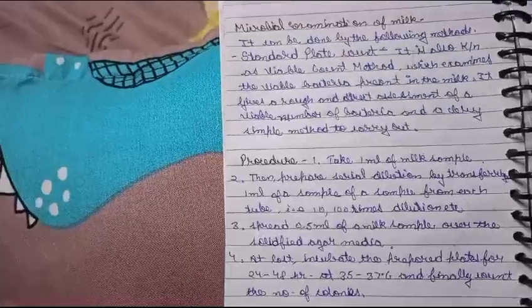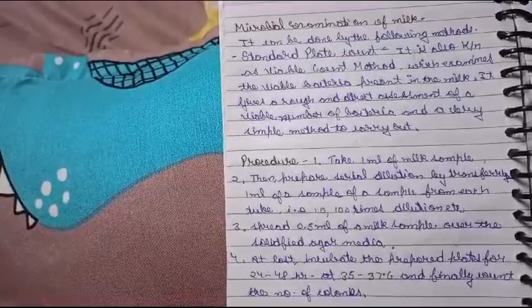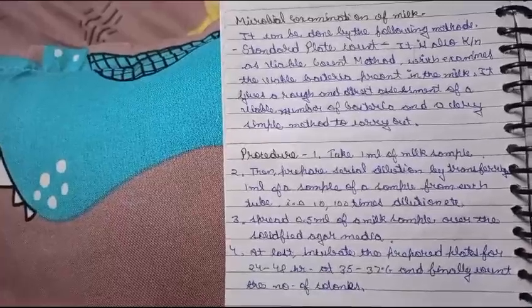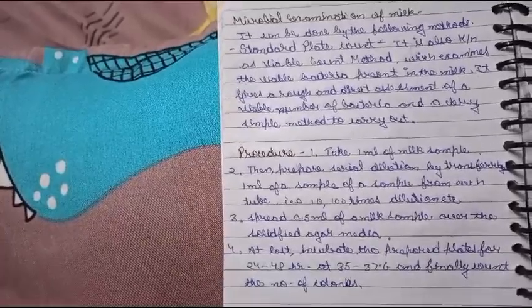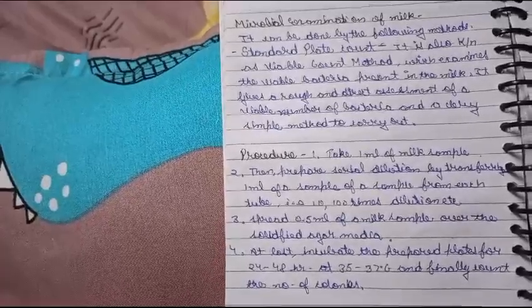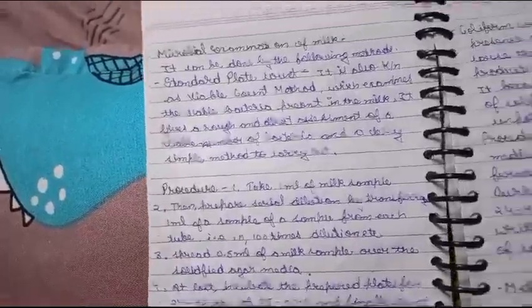from each tube, that is 10 to 100 times dilution, etc. Spread 0.5 ml of the milk sample on solidified agar medium. At last, incubate the prepared plates for 24 to 48 hours at 35 to 37 degrees Celsius and finally count the number of colonies.